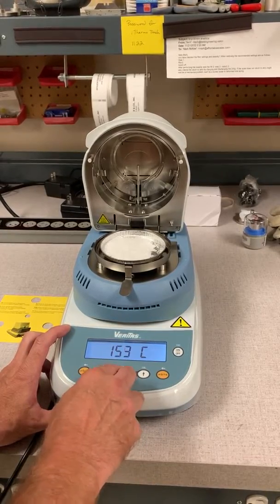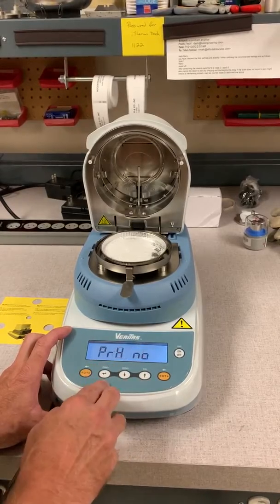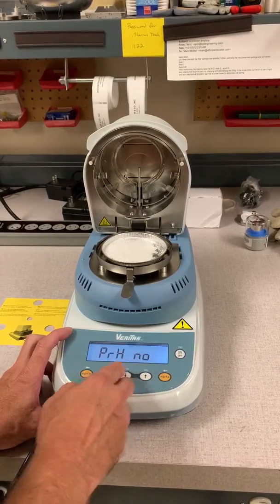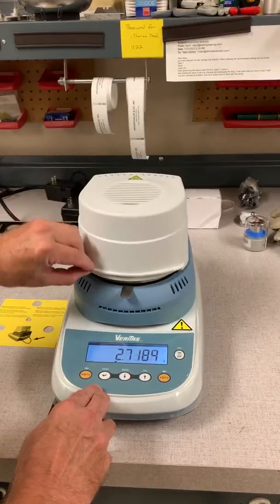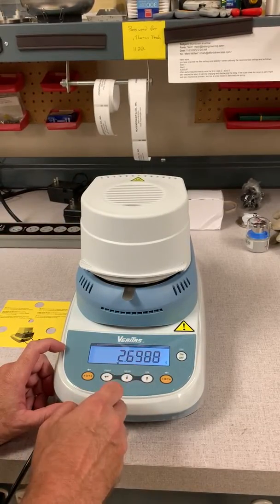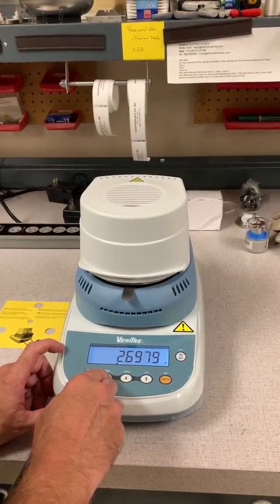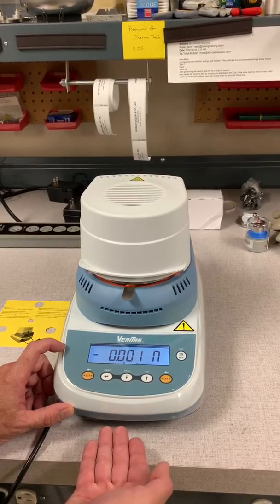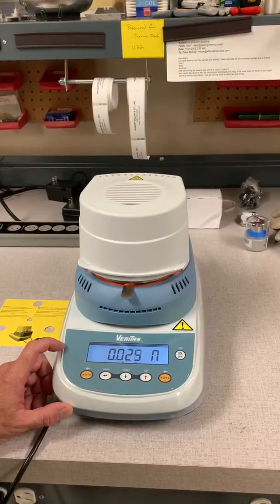This is for preheat. We're not going to preheat today's sample, so we're going to answer no. The test is ready — close the door, and once it stabilizes, press the print key to start your test. The chamber is heating up and away she goes.